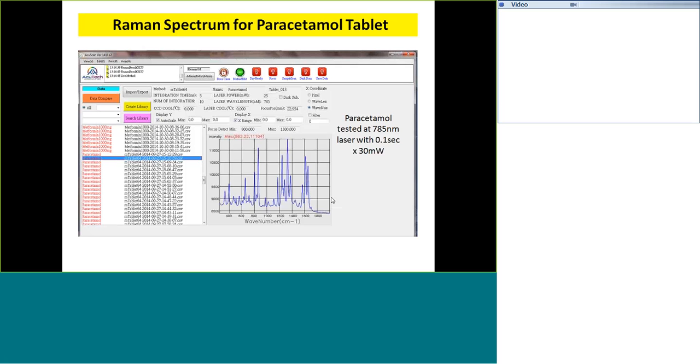Because, for example, a near-infrared system needs a lot of conditions for the instrument to work well, for example the temperature, the air, the light. Even with the microscope, you have to turn the lights off after you position your sample. Otherwise, the light in the room would affect your data. In this case, the sample is independent of the operator, because it is 100% one position. It moves inside, underneath the laser lens, from the same position, and you just optimize to the best intensity for the sample.